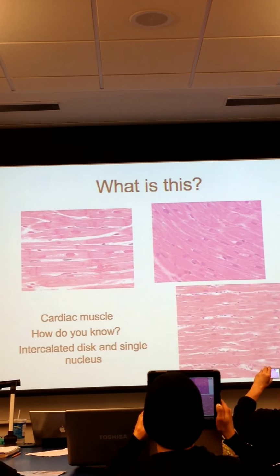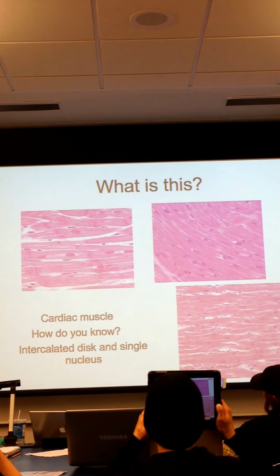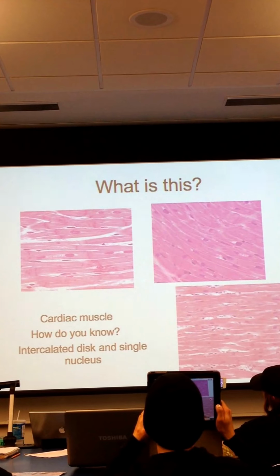Now, what did I tell you about the cardiac muscle in labs, guys? We can't always see the intercalated discs. So I would never pick a cardiac muscle tissue unless you can very obviously see the intercalated discs. Okay? But this is the identifier for your cardiac tissue. Branched and intercalated discs. You guys okay if I switch to the next one?